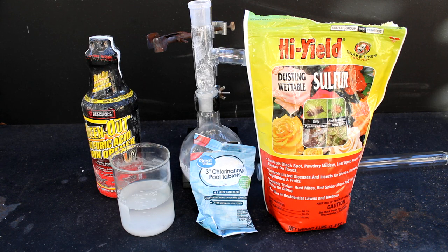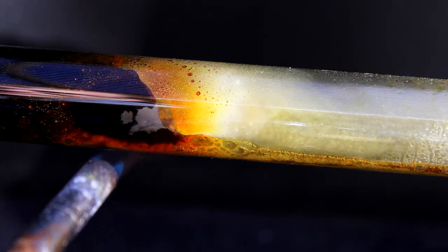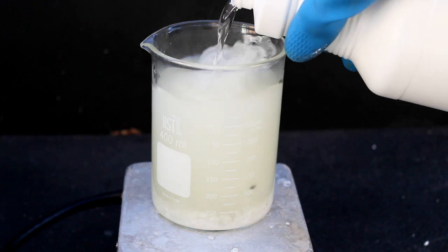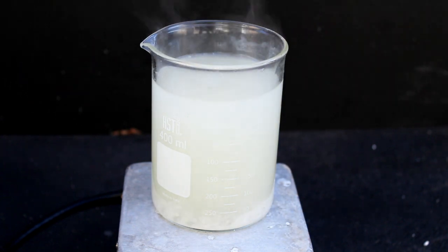For this synthesis, we'll only need three things: sulfur, a heat source, and chlorine gas. The sulfur was purchased at a local farm and gardening store as a powder, and my heat source of choice was once again a blowtorch. The chlorine gas was produced by reacting hydrochloric acid with TCCA-based chlorinating tablets. I didn't have any hydrochloric acid on hand, so I made some by reacting salt water with sulfuric acid.